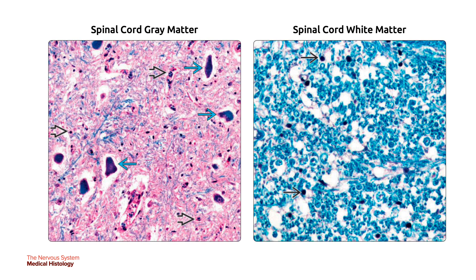On the right, the central canal of the spinal cord is lined by ciliated cuboidal or columnar ependymal cells in the bold black arrow. The lumen in the curved blue arrow is often obliterated in adults, containing CSF. The surrounding gray matter in the single black arrow is part of the gray commissure. On the left, the spinal cord gray matter contains multiple neuronal cell bodies and nuclei of various supporting glial cells amid a finely fibrillar neuropil of unmyelinated neuronal and astrocytic processes. The Luxol fast blue stain highlights the blue myelinated axons of the white matter and the small dense round nuclei of oligodendrocytes that produce the myelin sheath.